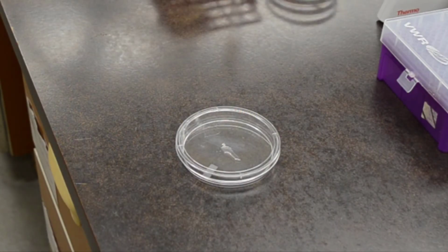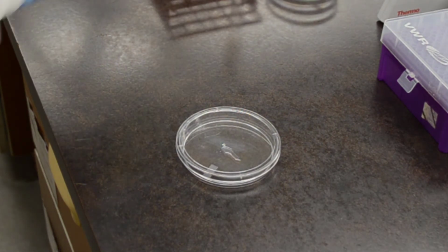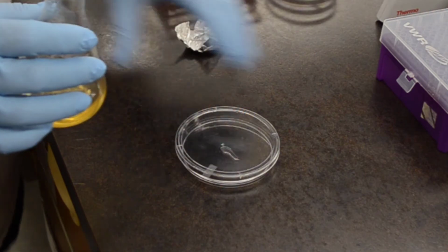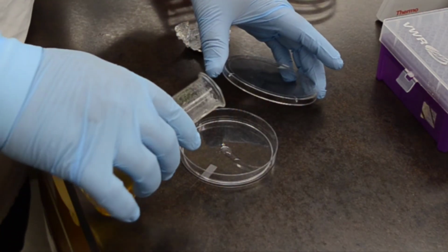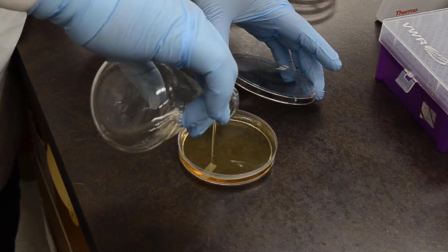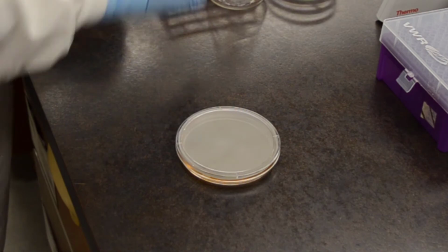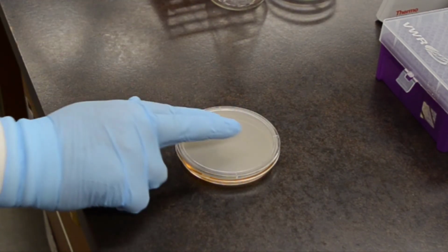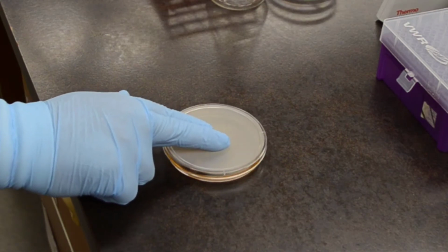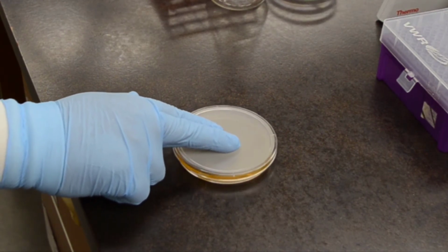You will then need to get a container of a sterile nutrient broth that has a solidifying agent mixed into it called agar. This is commonly used to create a gel-like solid medium in bacteriology because it is non-nutritive for almost all bacteria. Also, its melting characteristics are desirable for making solid media with ingredients that might be heat sensitive. Agar melts at about 85 degrees Celsius, but once melted it does not completely re-solidify until it reaches about 35 to 45 degrees Celsius.